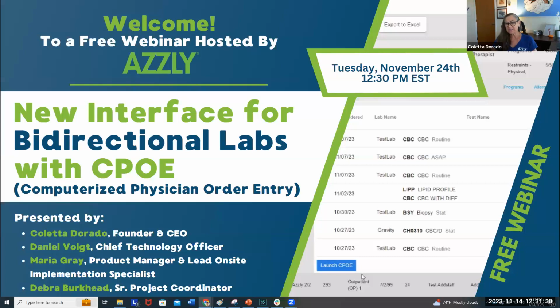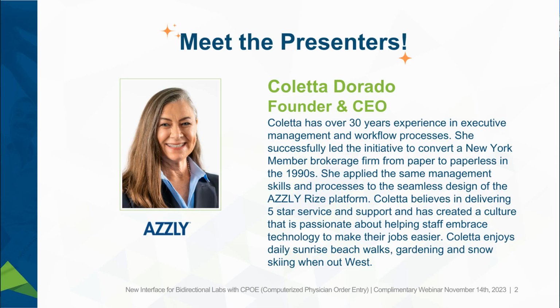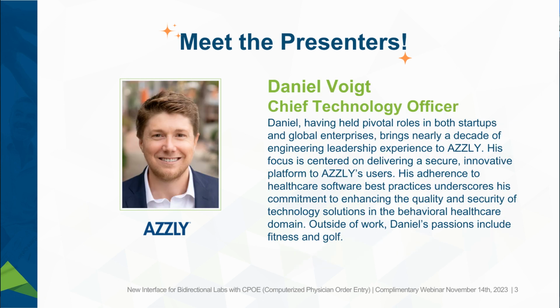We're truly excited to introduce the new interface for Bidirectional Labs with the Computerized Physician Order Entry via our LIS, LabSoft. Today, we have Daniel Voigt, who's our CTO. He was leading the design team behind this interface.